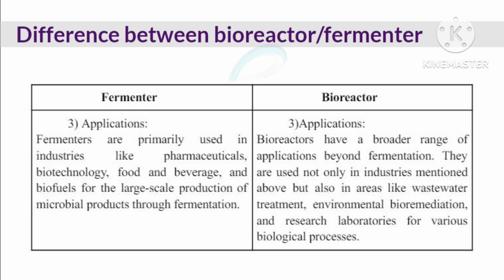That means a fermenter mainly has application in industry, whereas a bioreactor, not only industry, has a broader range of applications like we have discussed here: wastewater treatment, environmental bioremediation, and research laboratories.